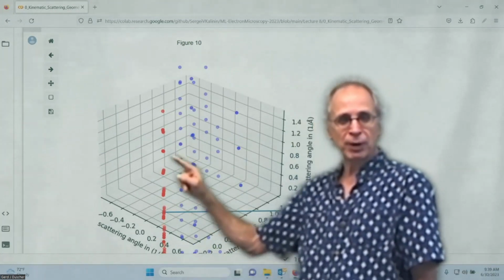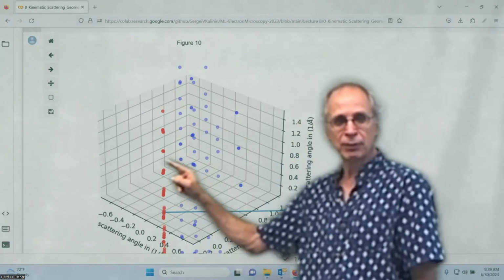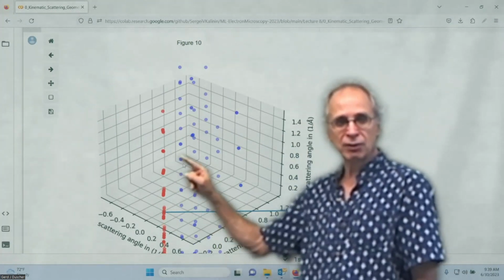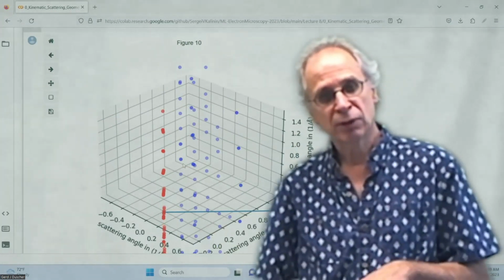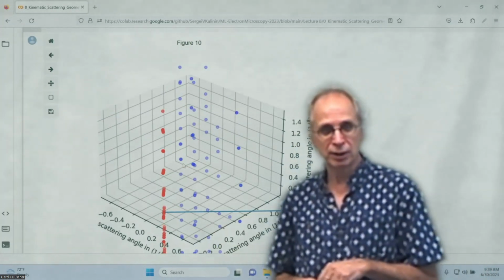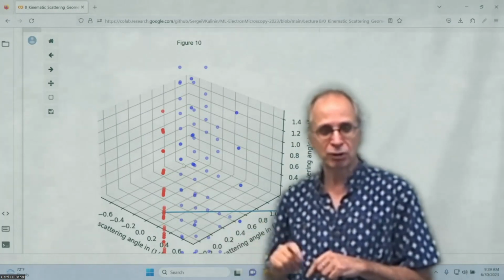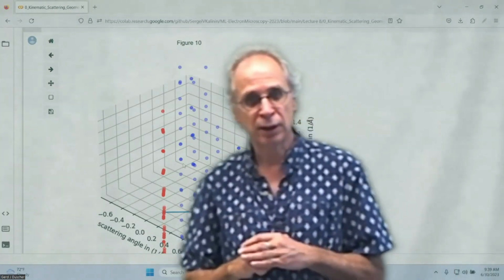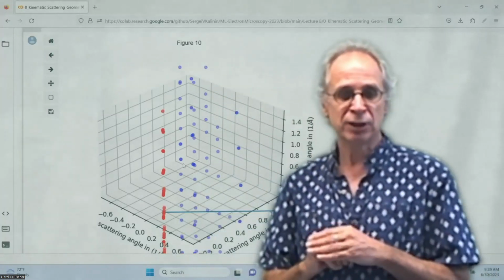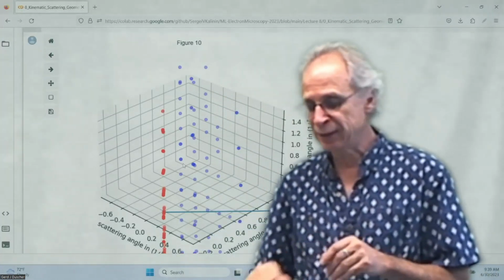So from this plane to that plane, this is the third dimension of your unit cell. And so it means we now have information about the third cell. And that means you can get the full strain tensor out of a single diffraction pattern. So that's the idea behind it.